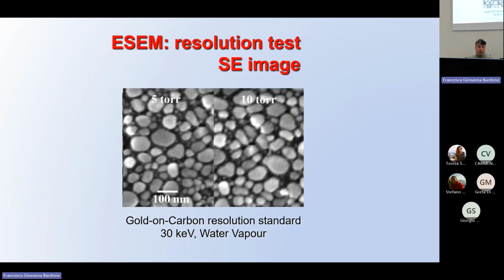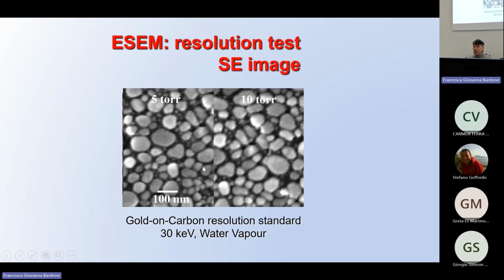Okay, this is just a resolution test. You can go down to 2 nanometers in resolution, even in the presence of water vapor over the sample. At 5 torr and 10 torr, you have a resolution of 5 nanometers.